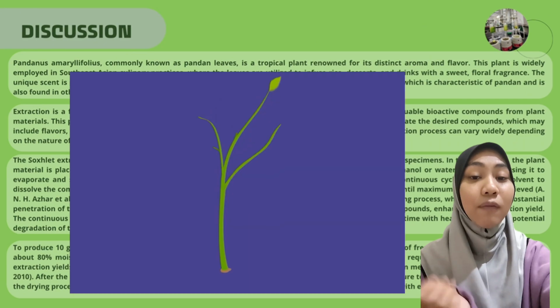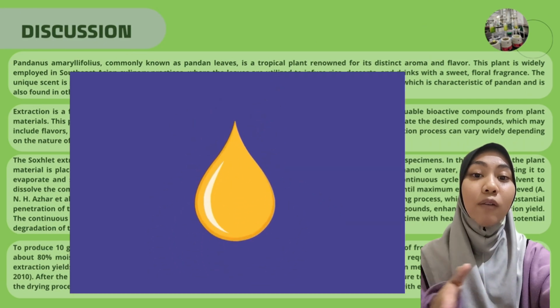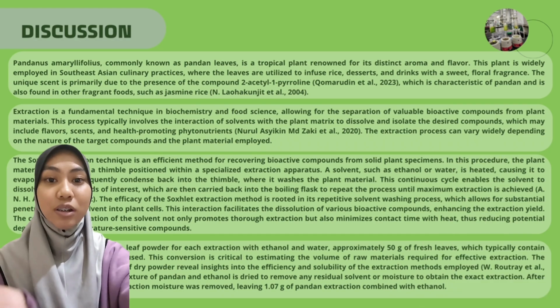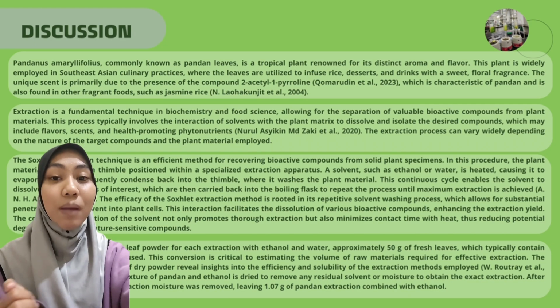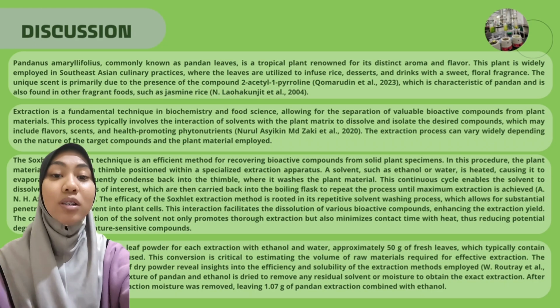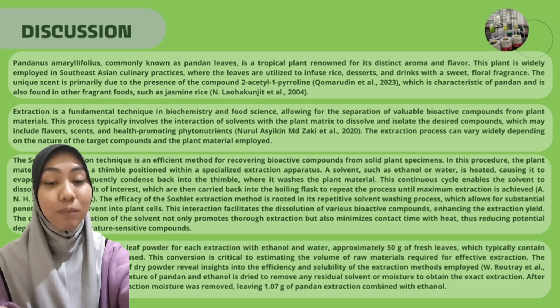Extraction is a fundamental technique in biochemistry and food science, allowing for the separation of valuable bioactive compounds from plant materials. This process typically involves the interaction of solvent with the plant matrix to dissolve and isolate the desired compounds, which may include flavors, scents, and health-promoting phytonutrients. The extraction process can vary widely depending on the nature of the target compounds and the plant material employed.